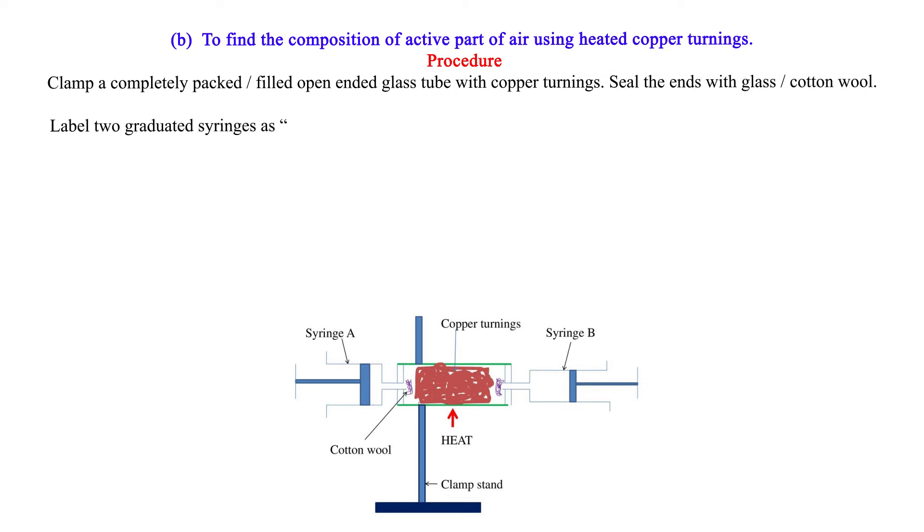Label two graduated syringes as A and B. Push out air from syringe A. Pull in air into syringe B. Attach both syringe A and B on opposite ends of the glass tube.